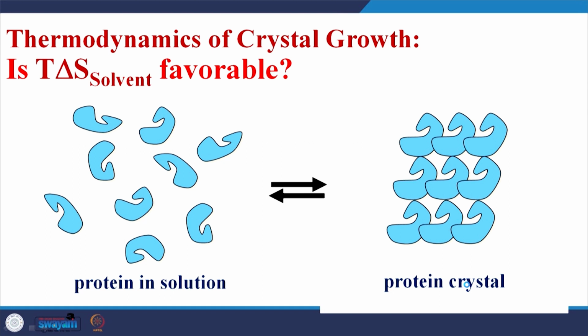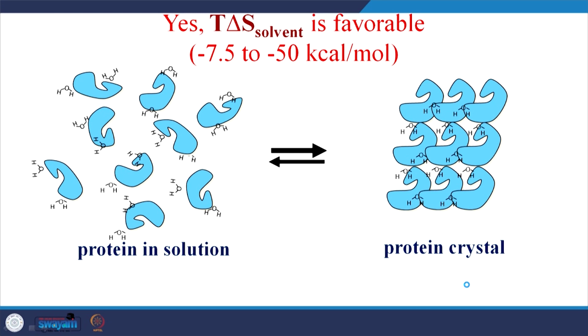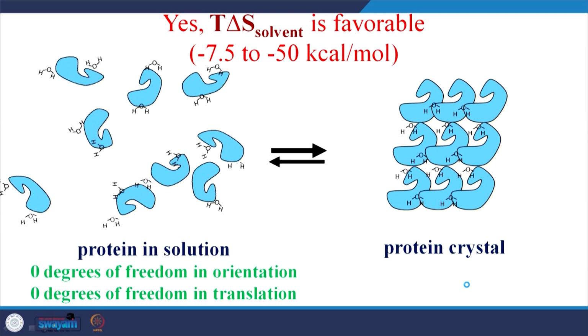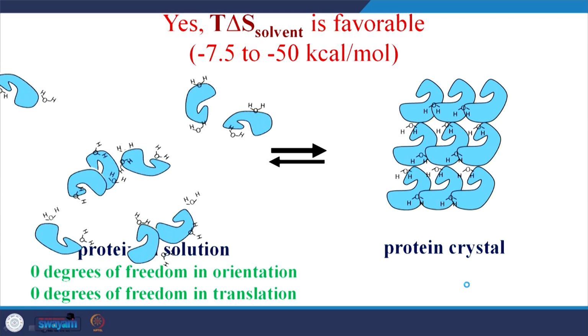Next question is, is T del S solvent favorable in time of crystal growth? This is the protein in solution and this is the protein in crystal. Now, you see, in case of protein in solution, though the protein is moving, the water molecules are attached with the protein. So, the water molecules are moving, but they do not have apparent movement. It is like you are in a car going from one place to another, but you are not moving, right.